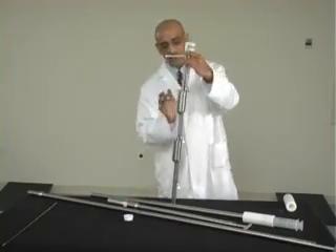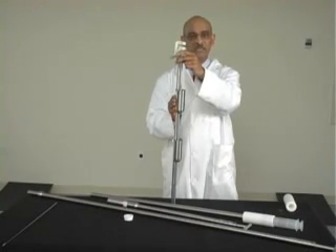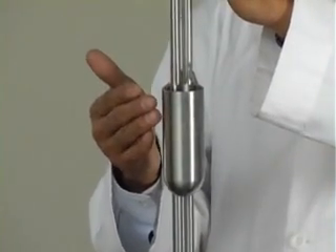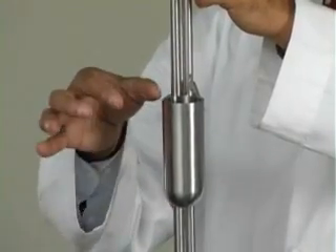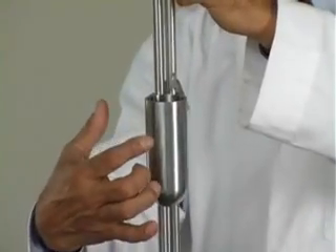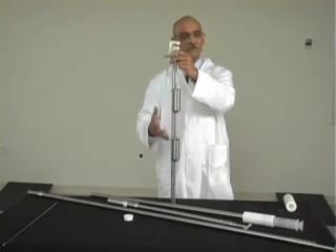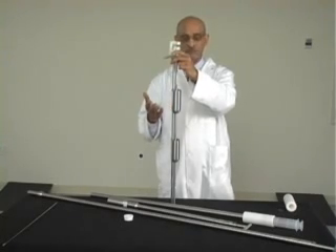The cups here come in three different sizes: small cup, medium cup, and large cup. This is a small cup. You can put bottles in there of any size, as long as it fits inside the cup lengthwise as well as diameter-wise. The medium cup is much larger, and you can go up to 500 cc bottles in the medium cup. The large cup is quite large, 7 inches deep, and you can use bottles up to a liter.